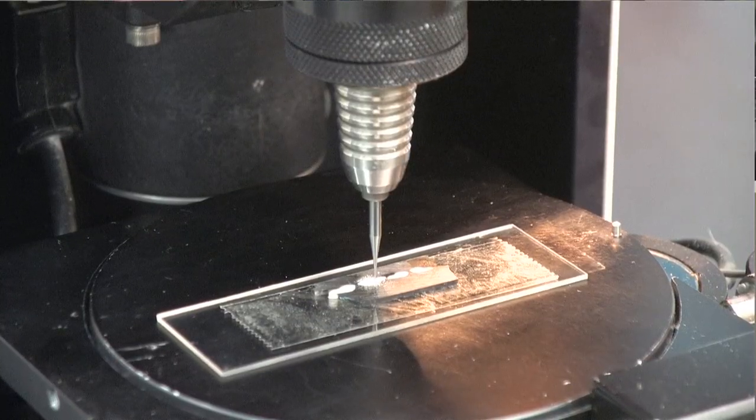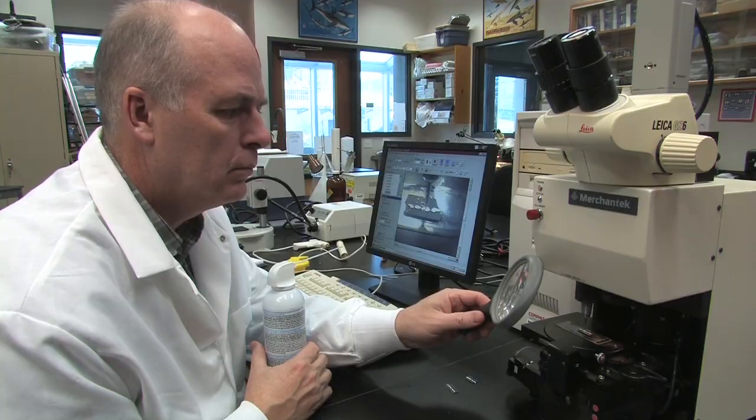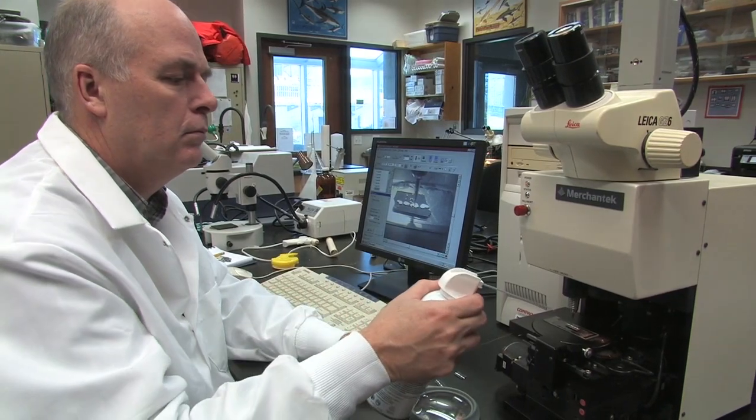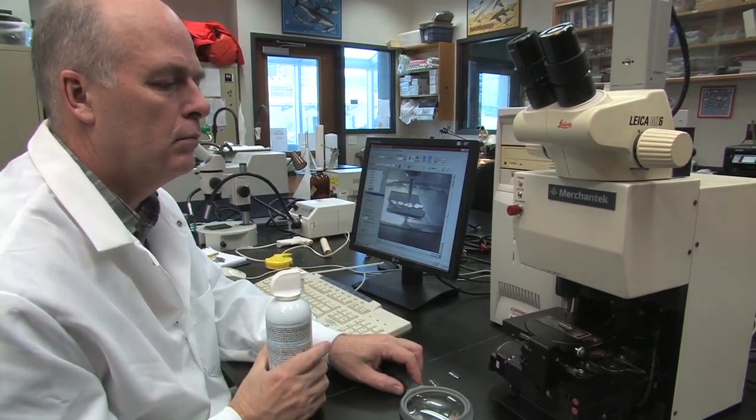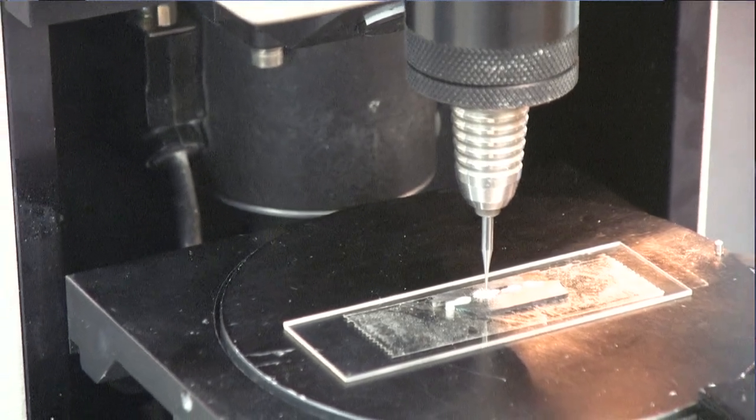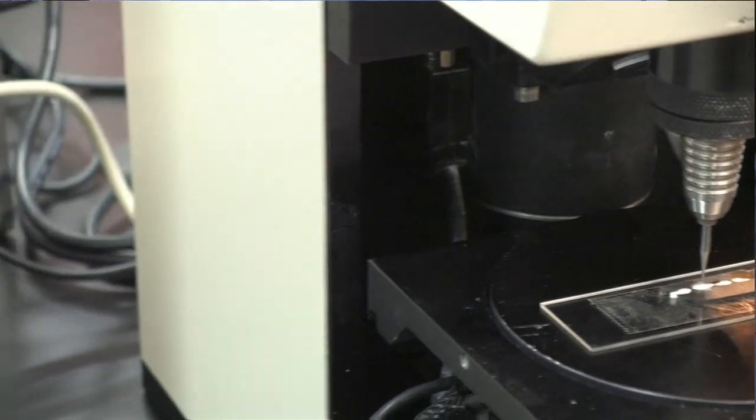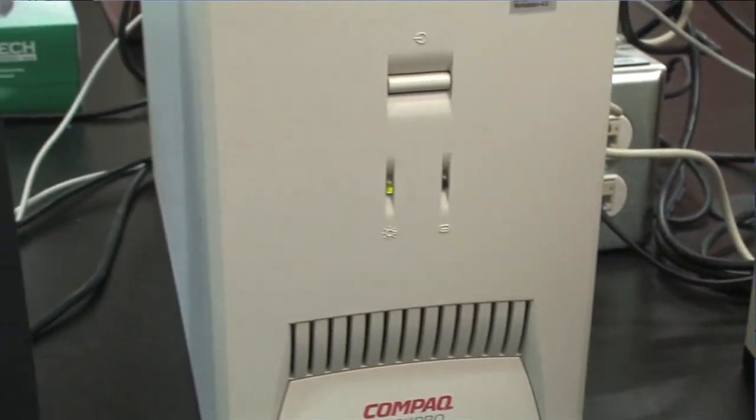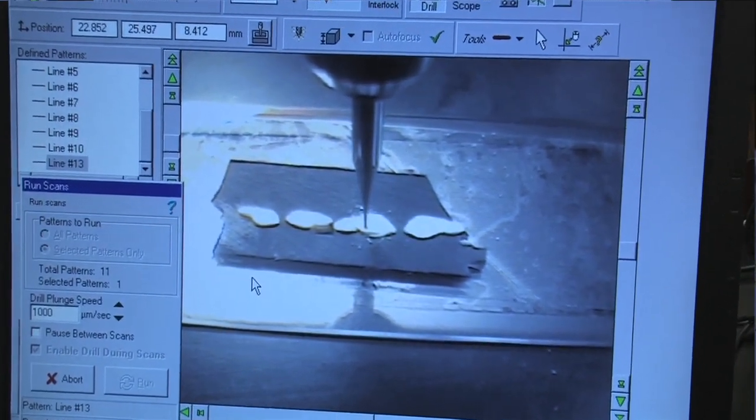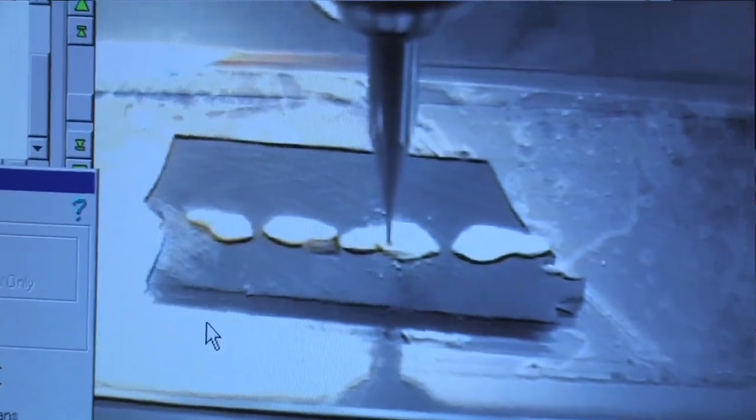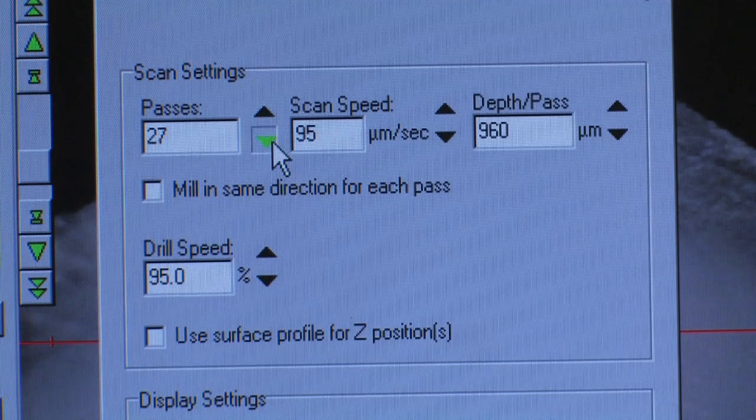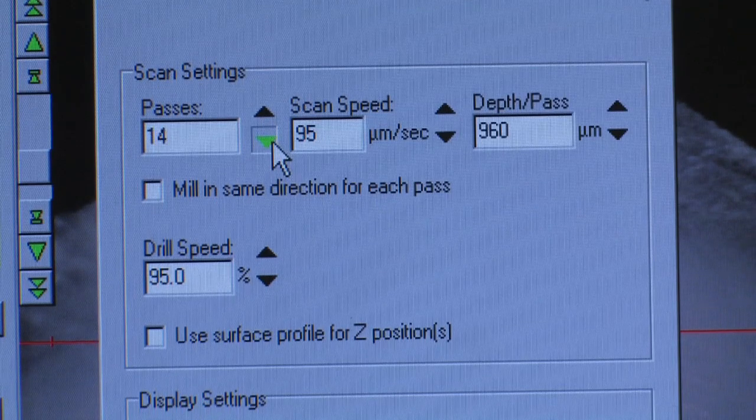As the Micromill drills the sample, you can check the progress with the magnifying lens. You can also use a can of compressed air to clear away any powder that builds up. When the sample is almost finished, it may need another pass or two to be completely free from the rest of the otolith. You can set the drill to do a singular pass but be sure when you set up the drill sequence that you add the depth you have already drilled. For example, if you already drilled a one millimeter section down to 930 microns or 31 passes, set the drill depth to 960 microns and run the drill scan for one more pass to free the sample.